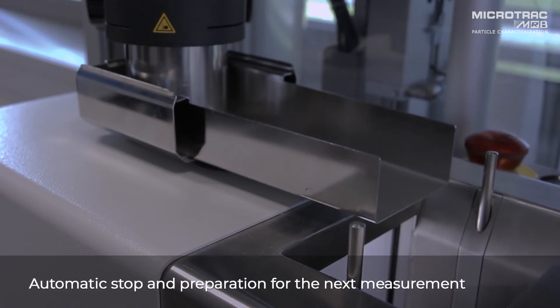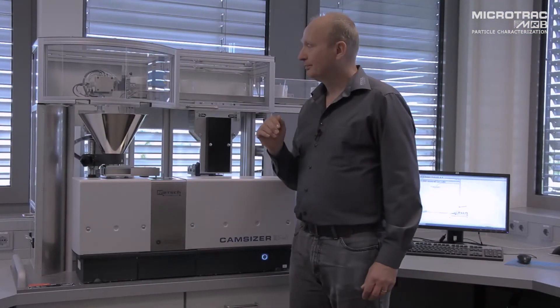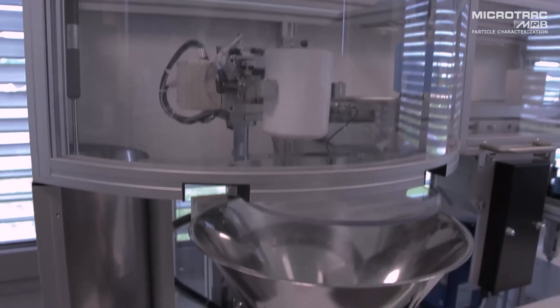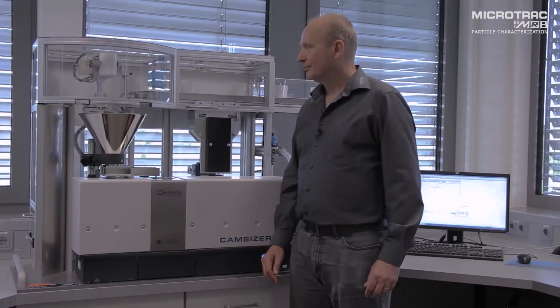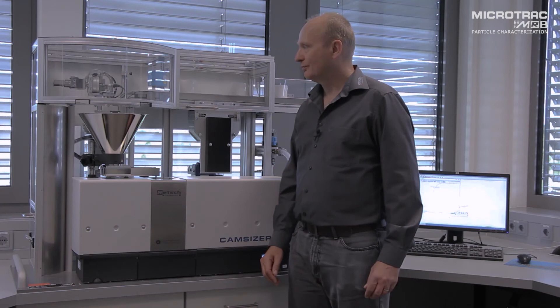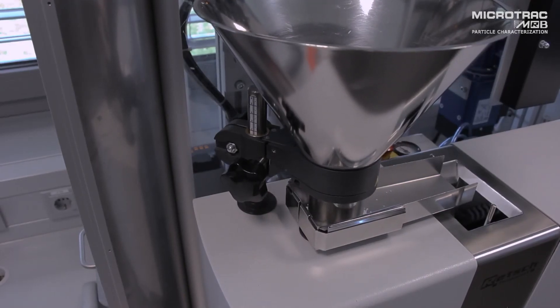The hopper will drop ready for the next sample, which will then be picked up by the robot and agitated and placed into the hopper. And the analysis once again will start automatically.